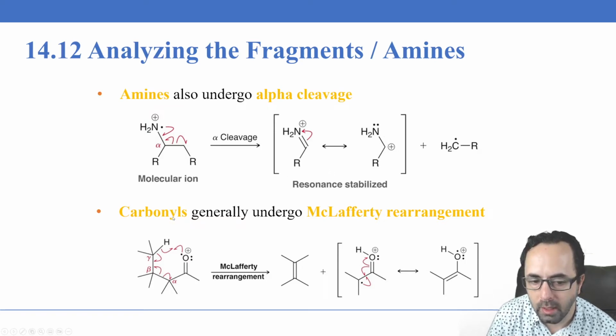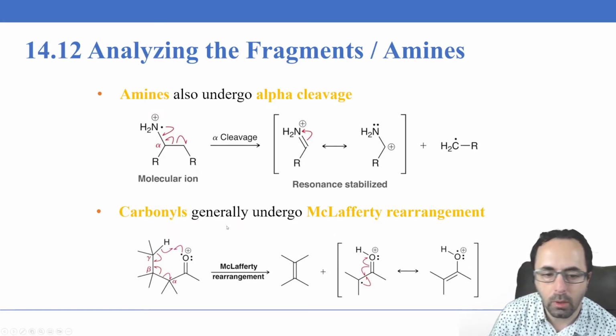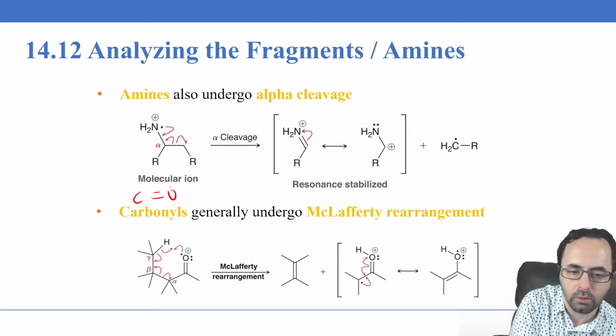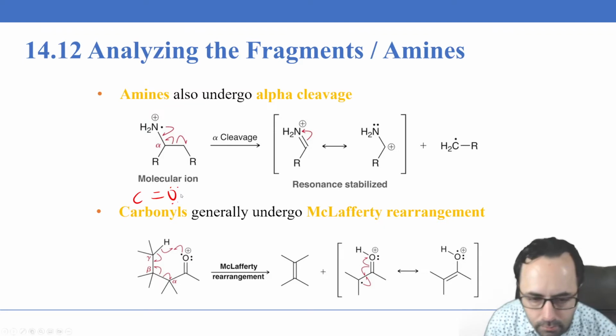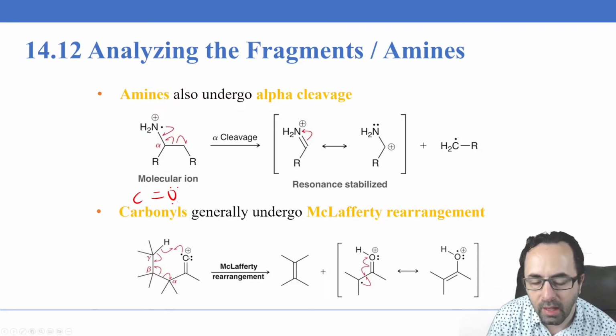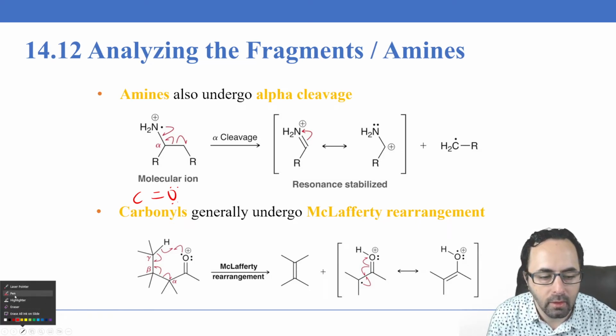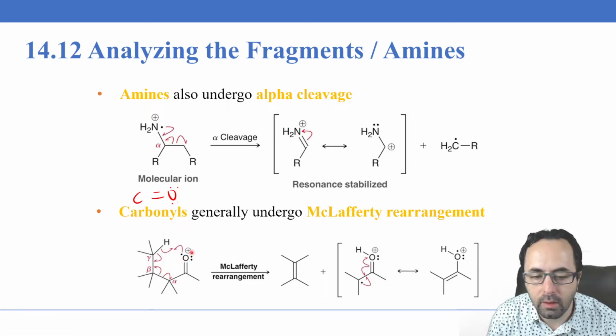If you have a carbonyl, you're going to get something very fancy. So what a carbonyl is, when you have a carbon double bonded to an oxygen, that's called a carbonyl. So here we have a radical cation that's a carbonyl. So you can see that there's one electron missing right here, right? And so that electron has been removed, so it's a cation. And these, remember, in real life, these molecules are rotating around and spinning around.